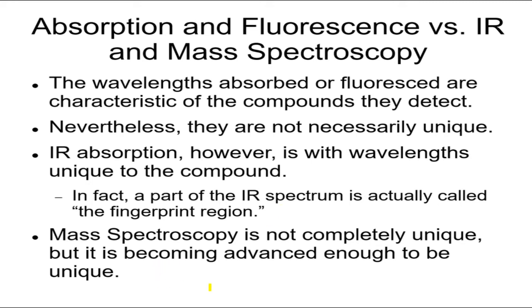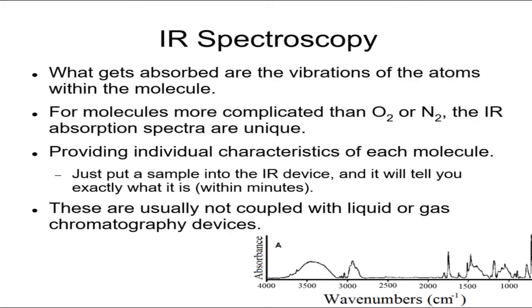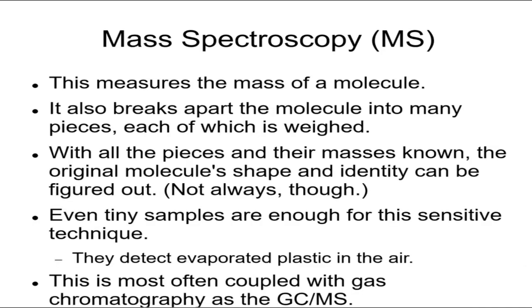Now, it's not just that. Again, it's not more complicated, but with mass spectroscopy, we can do a similar thing and get something similar to this, though it doesn't look like this. It's more like straight lines, more separated from each other. But you also get a lot of signal, a lot of different peaks from a mass spectrometer. Now, the thing about mass spectrometry, we'll look at this for now.